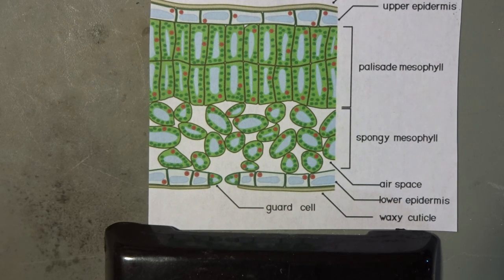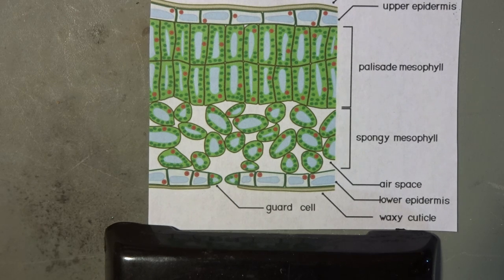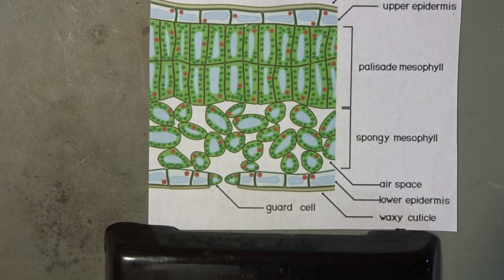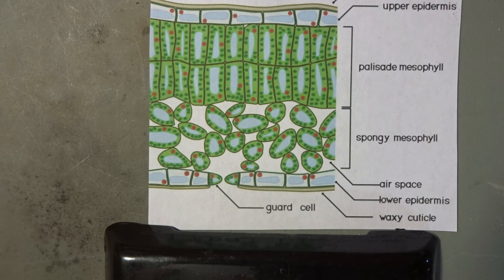Notice the parts of the leaf with the different types of cellular structure are all labeled. The waxy cuticle covers the plant's leaves and reduces desiccation or water loss from the plant. The epidermis helps the plant retain water. The epidermis is a one-cell cellular layer that secretes a waxy substance that is the cuticle. In woody plants, this tissue is more corky and stiffer.